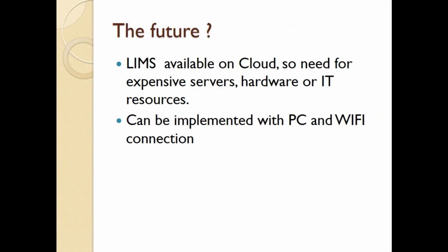So what does the future hold for LIMS or for laboratory information systems? Some of the things that maybe are in the future is to have the LIMS system available on cloud, so there'll be no need then for companies to purchase expensive servers. The hardware, obviously, and the IT resources then don't become an issue. We can also think about implementing LIMS with PC and Wi-Fi connections also, so they can be remotely accessed. So LIMS is starting to gain a lot more momentum in the manufacturing facilities because of the huge advantages that it brings with it.